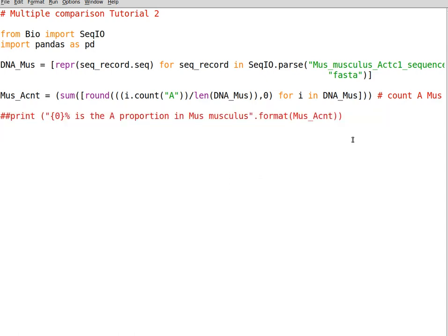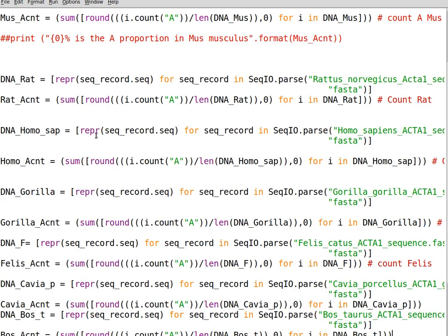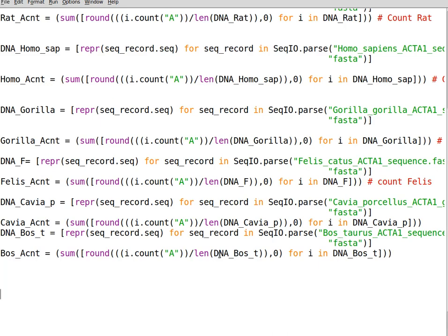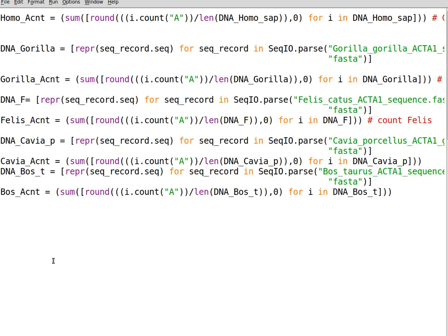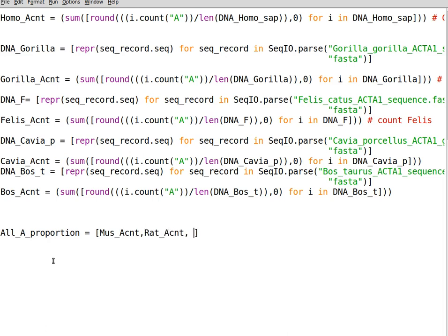You can comment that print statement out. I did the same thing for the other species: rat, Homo sapiens, gorilla, Felis catus, and others. Just copy and paste for the sake of this tutorial. Now we need a list containing all of the adenine proportions, assigned to a variable — all_adenine_proportions — which includes the values for Mus musculus and the other species.